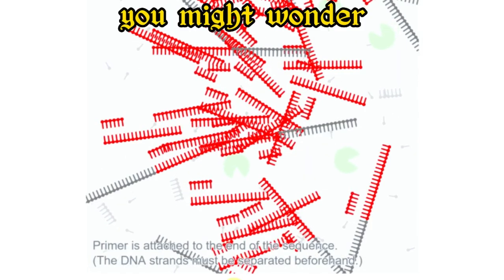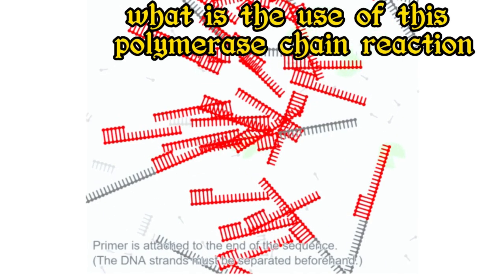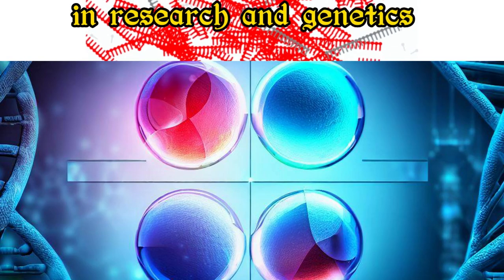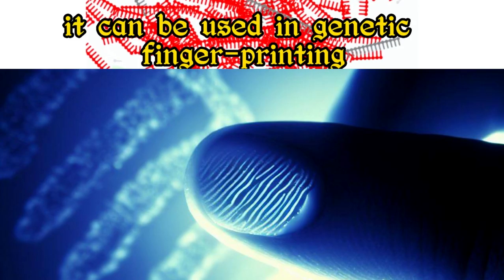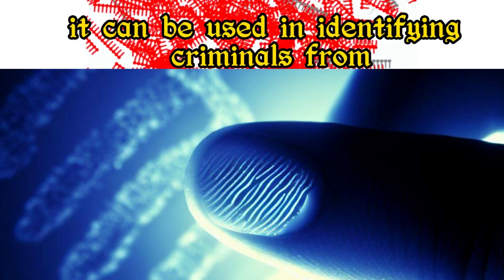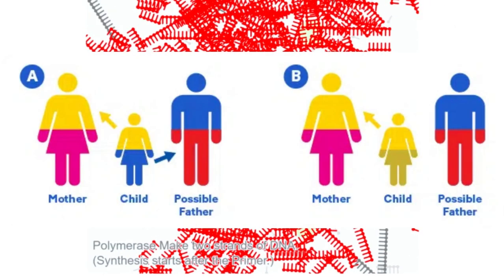You might wonder, what is the use of this polymerase chain reaction? PCR is used in forensic science, in research and genetics, in medicine, and can be used in many different ways. In forensic science, it can be used as a diagnostic tool. It can be used in genetic fingerprinting, in identifying criminals from a large population, and in paternity tests.